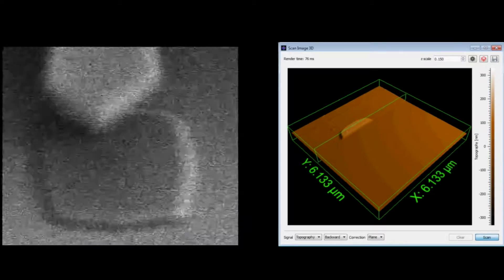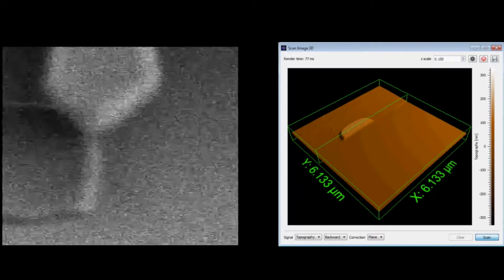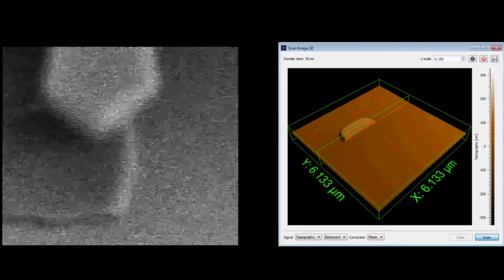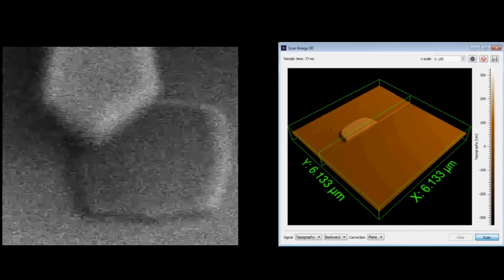In this manner we can measure objects, wafers, glass plates or masks of different thicknesses from 0.5 to 7 millimeters.